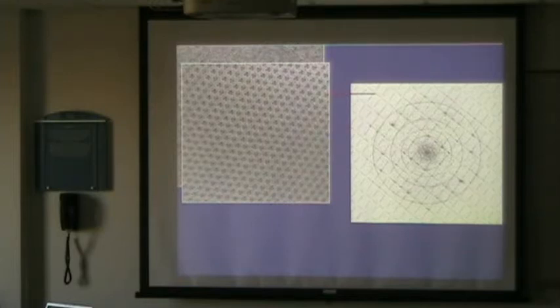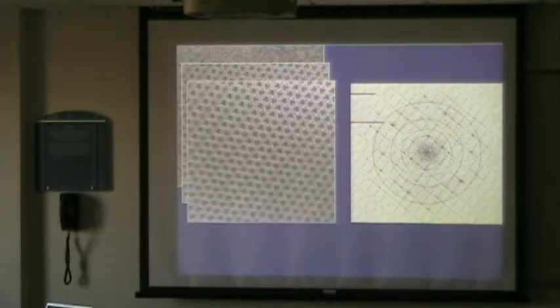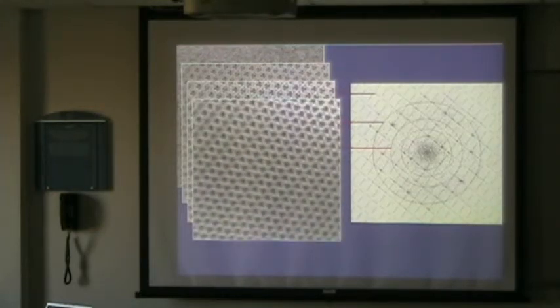Yeah. Now I can also actually screw up the resolution if I want, and if I go lower and lower in, I don't know how familiar you are with diffractions these days, but the lowest resolution is in the center, the highest resolution is out here. And when I shrink this whole thing, I basically screw up the resolution. Okay. When I take this, you see, now you still have the 3 holes. I don't know, it depends how much you used to look at this thing. It may look even a bit better, but there's quite a bit of detail lost already, like these walls and so on, things like that. It's definitely getting more dramatic here. Now I don't even see these.